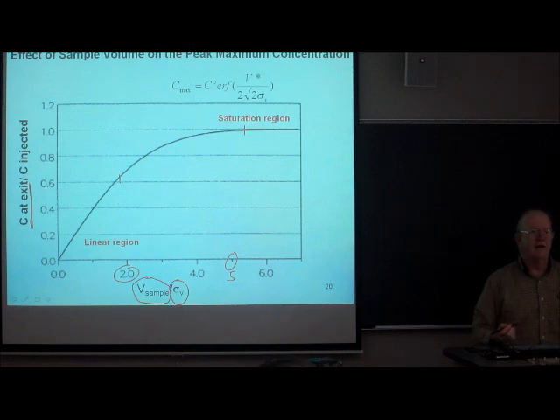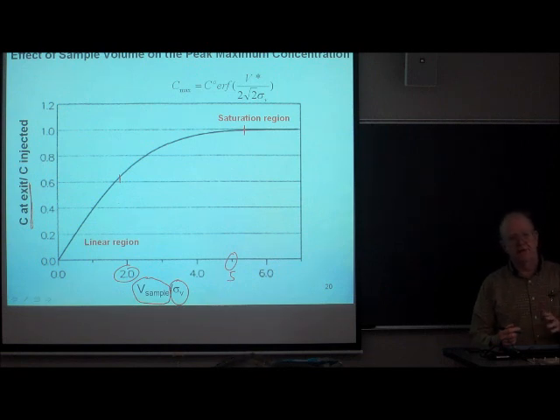This has an awful lot to do with your analytical sensitivity. If you inject a microliter versus a tenth of a microliter, you're going to see a peak which is a lot bigger in area and a lot bigger in height. If you inject a 10 microliter sample, you're not going to see a signal which is 10 times bigger than a 1 microliter sample in height, but it will be 10 times bigger in area.